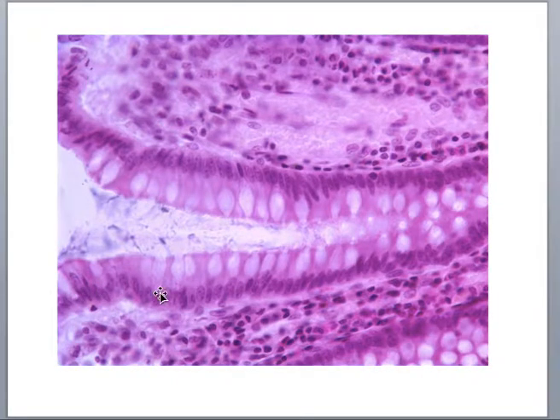Here's another image of simple columnar epithelium. This is from the intestine, most likely the large intestine. And I just wanted to point out, so again, this would be the basement membrane. This would be the apical space, right? So basement membrane, because this is all connective tissue. You can see the nuclei are oval shaped, located towards the basement membrane, but it's not really super jumbled. It's easy to tell that this is a single layer of cells, and look at the height of these cells. They're columnar.